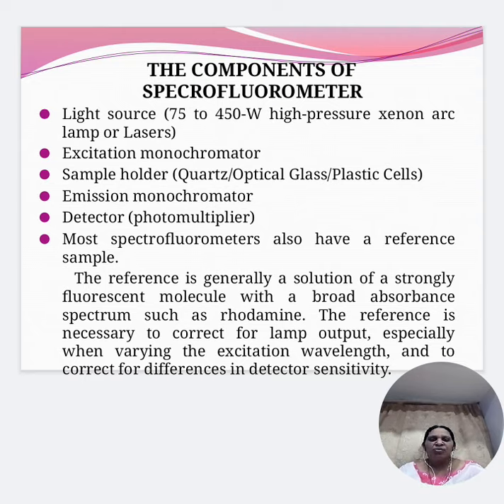It can be either quartz or optical glass or plastic cells where the sample is held. Then you have the emission monochromator. Then the detector is usually a photomultiplier tube. Most spectrofluorometers also have a reference sample.